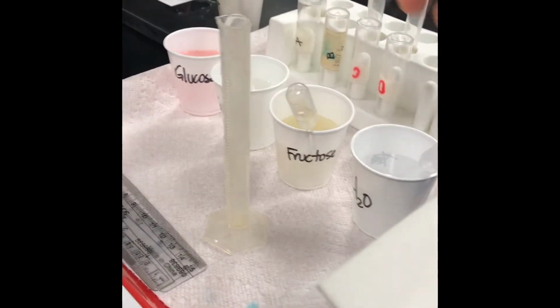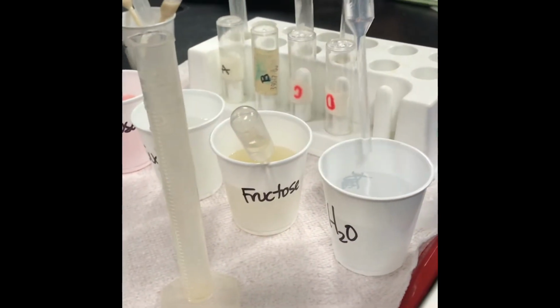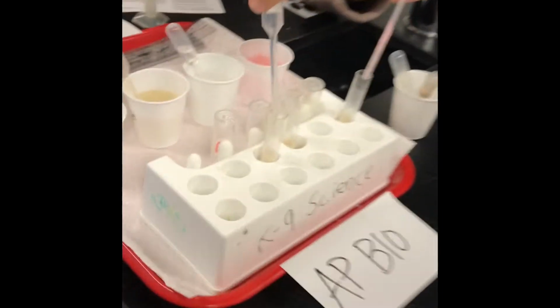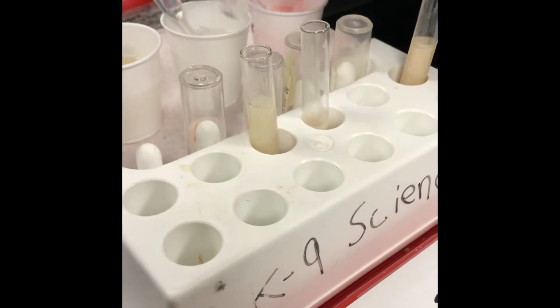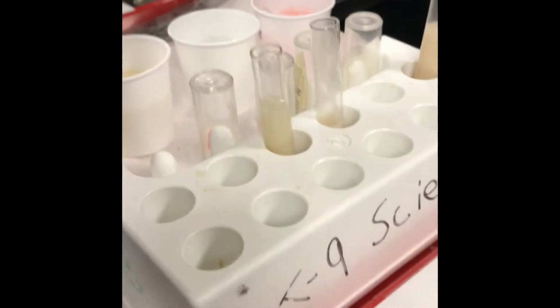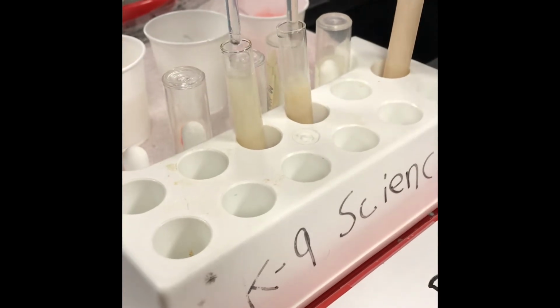going to show you all my beautiful labeling job of the cups. We've got glucose, sucrose, fructose, and distilled water. They're going to take these and fill them to the brim on top of the yeast, so you guys can experience this amazing lab. There's no measurement needed on the sugars or the water. You just fill it up to the brim.